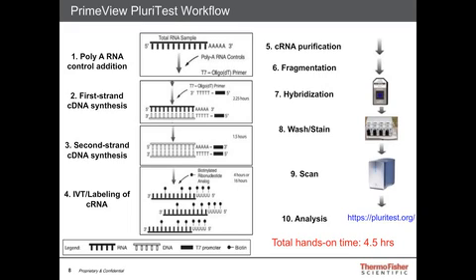This is followed by purification, fragmentation, and hybridization to the array. After washing off non-specific and excess probes, the chips are then scanned. The assay utilizes an online cloud-based analysis software to get the results.